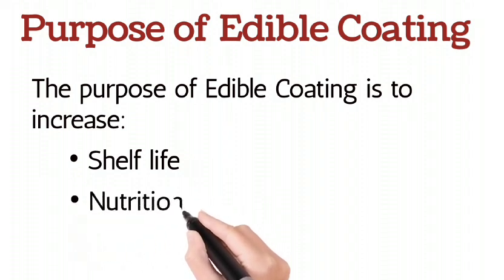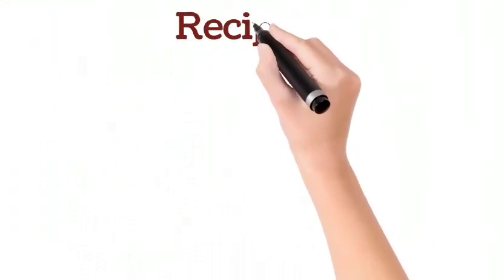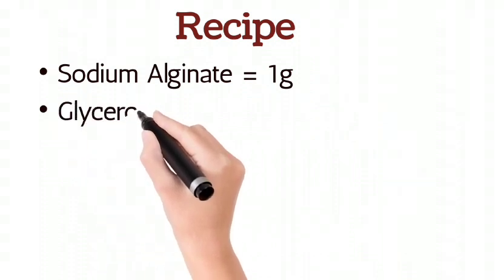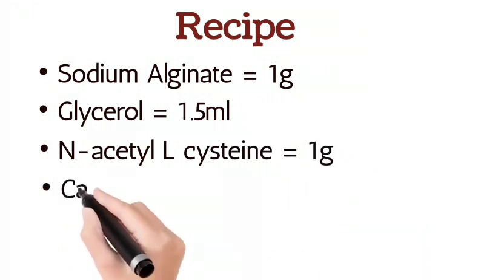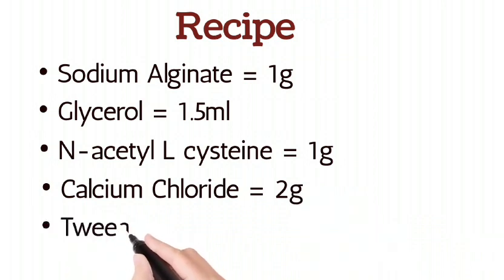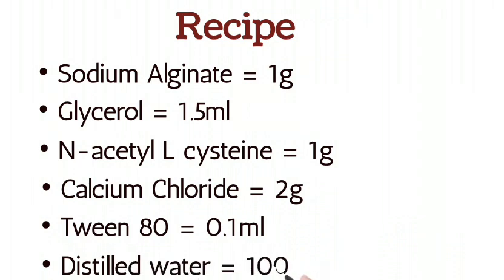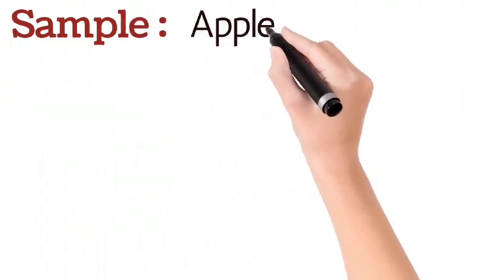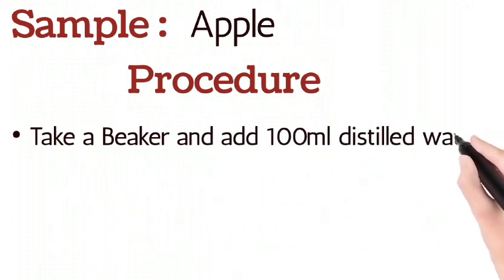Recipe: sodium alginate 1g, glycerol 1.5 ml, N-acetyl L-cysteine 1g, calcium chloride 2g, Tween 80 0.1 ml, distilled water 100 ml. Sample: apple. Procedure: take a beaker and add 100 ml distilled water in it.